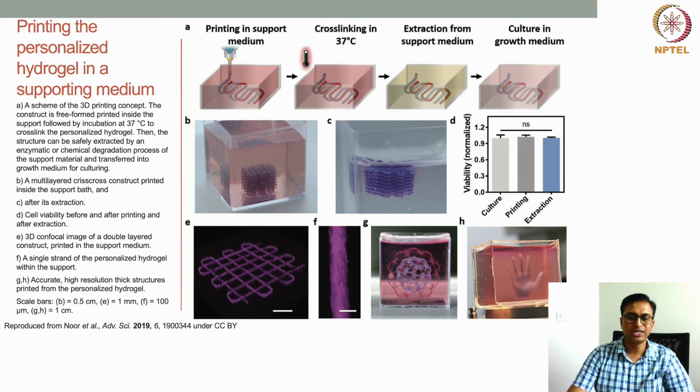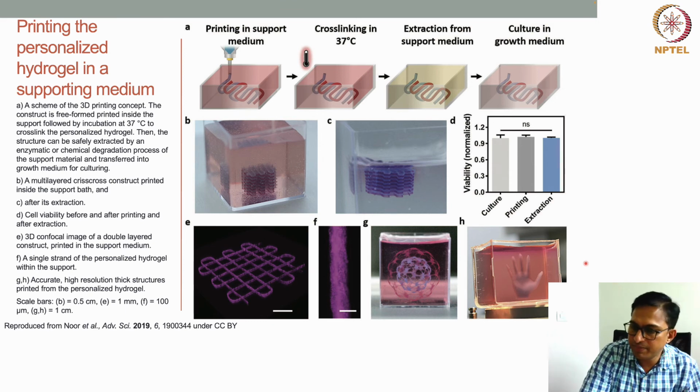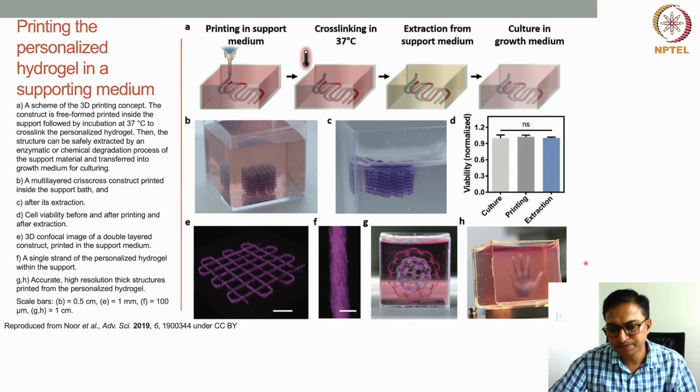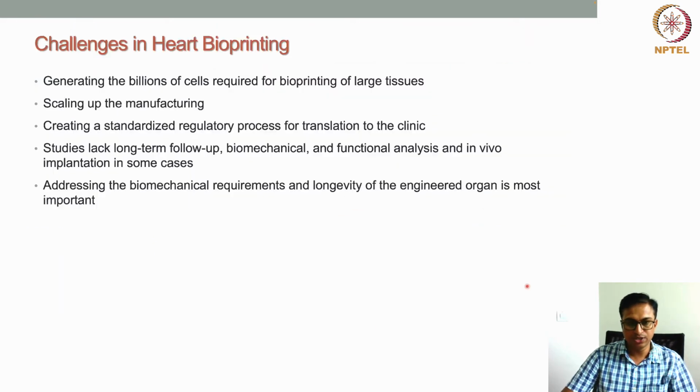They have also shown that a complex, highly accurate, high resolution thick structure can also be printed with the personalized hydrogel, like in G and H. These are two different structures printed with the same hydrogel that they have developed. So the important thing is that this hydrogel can be very well used for printing different types of complex structures. That is the possibility with this hydrogel.